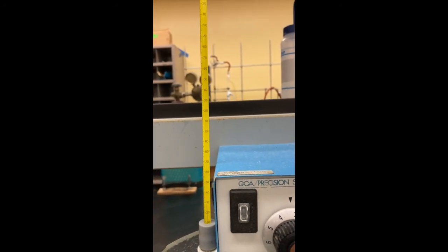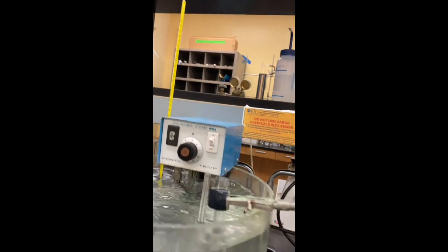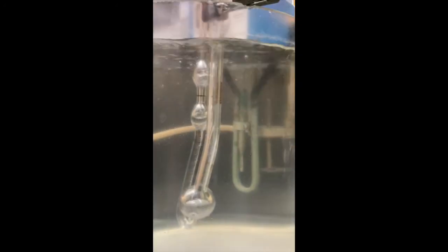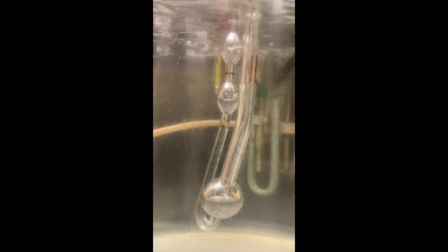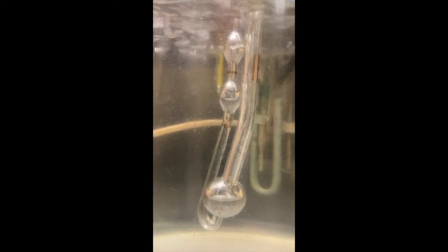It's critical that all the measurements of pure water and solutions with different concentrations of cleaved polymer are taken at a constant temperature. You can see now the liquid is about halfway between the upper mark and the lower mark, about 2 minutes and 15 seconds since we started.